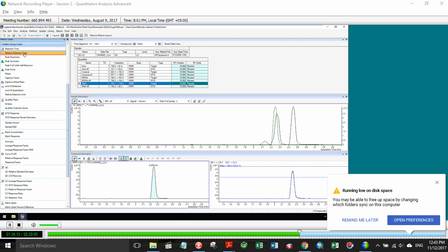Let's see if I can find one that, no. Yeah, keep going. And of course, yeah, keep going. I'll find one eventually. Yeah.